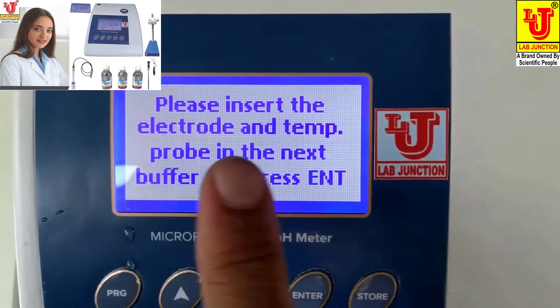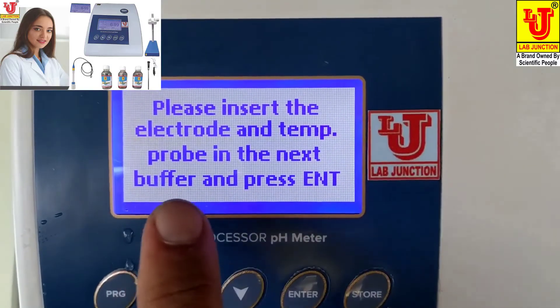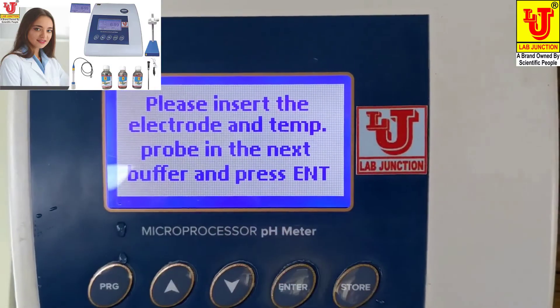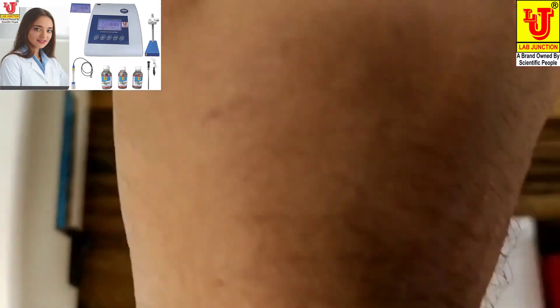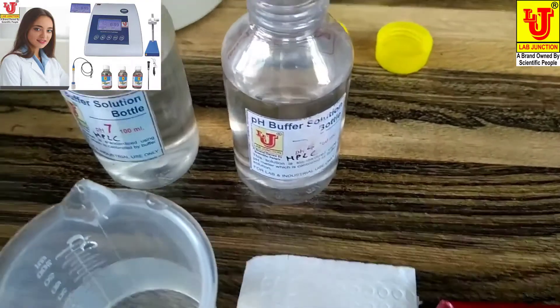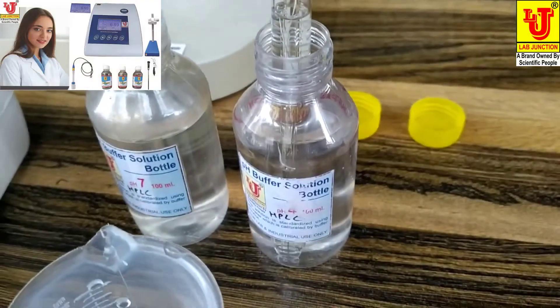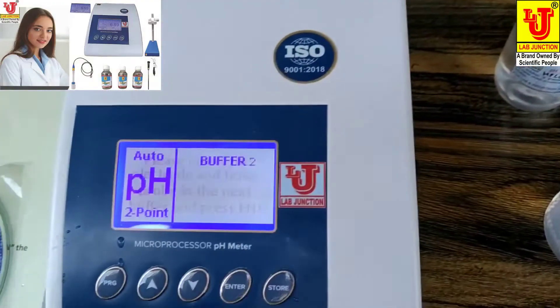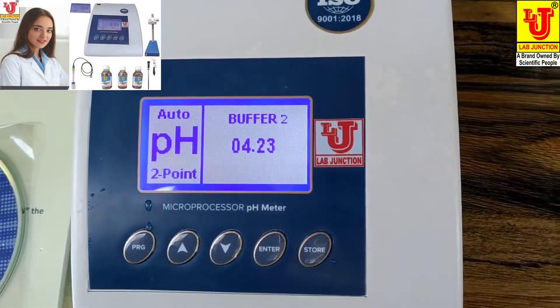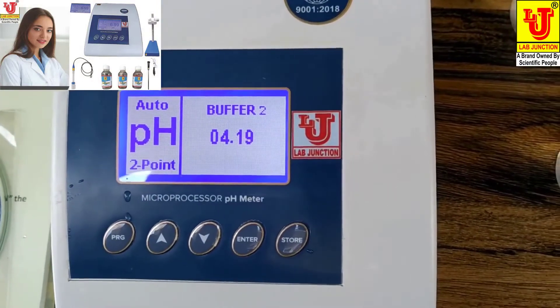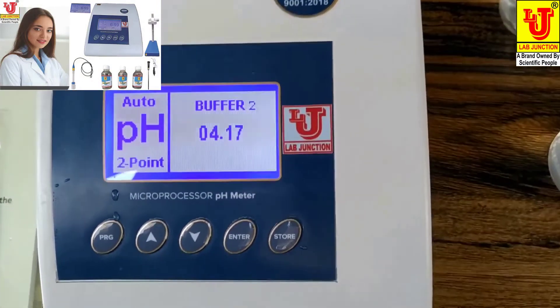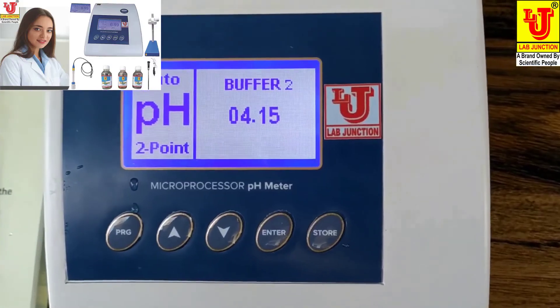Now the instrument can say please insert electrode and temperature probe in the next buffer and press enter. You can dip your pH electrode to pH 4 buffer bottle and press enter. Again, it can achieve its value to 4 pH.